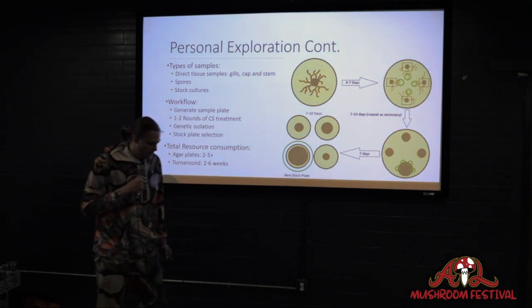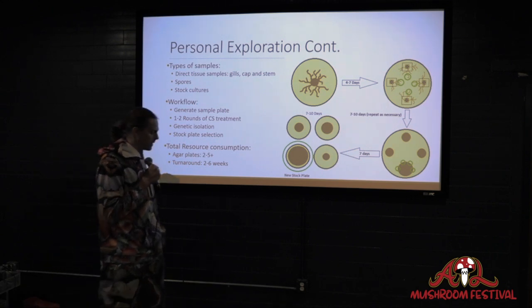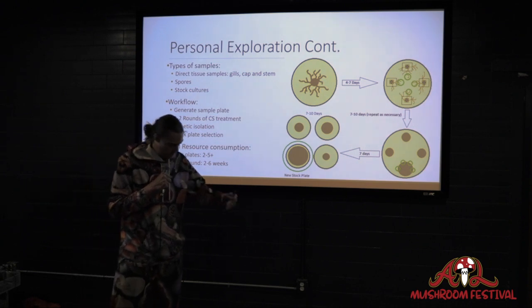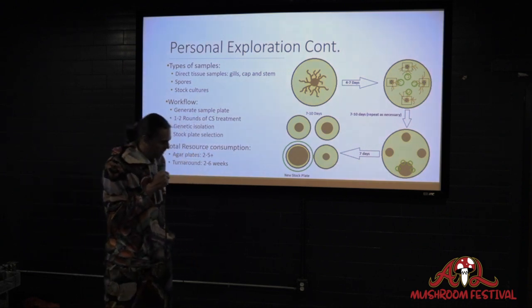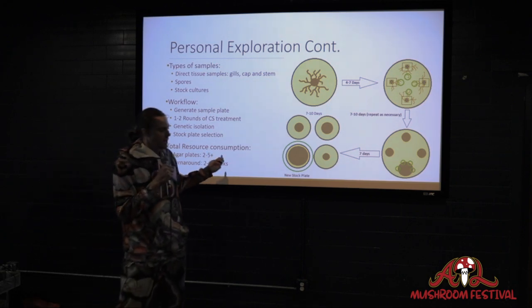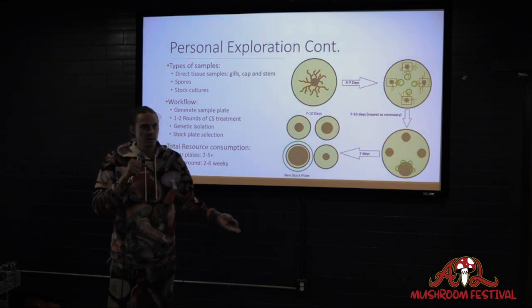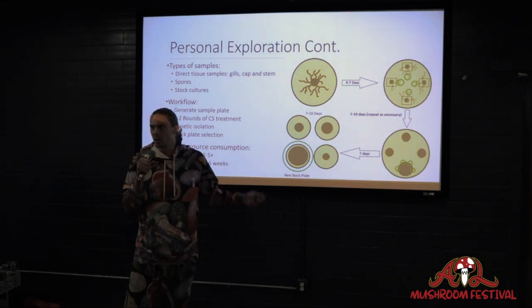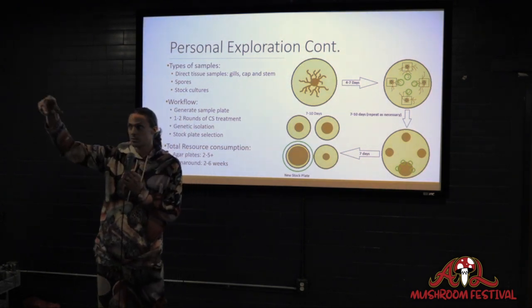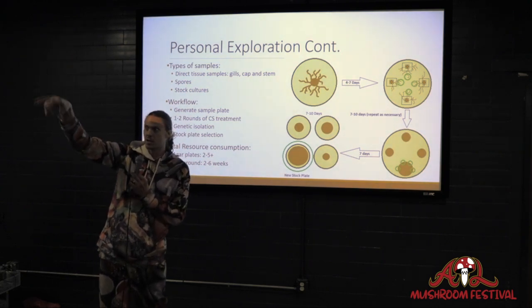Yeah, so the question was, is putting it on the first agar plate a form of training the mycelia to grow in the environment that you're creating in the lab? And that's exactly correct. Yeah, it's a part of the process because it's never seen agar. Agar doesn't exist in a tree, right? All these other nutrients you put in the agar, dextrose being the monomer of cellulose, that's what the mushroom is going into the tree, taking the cellulose, breaking it down into dextrose.